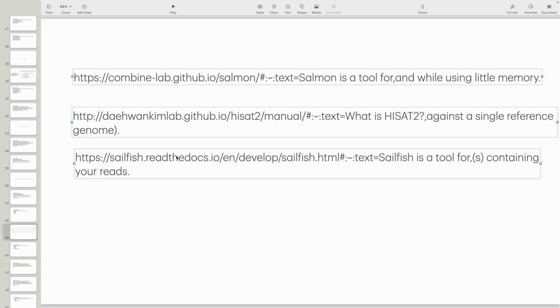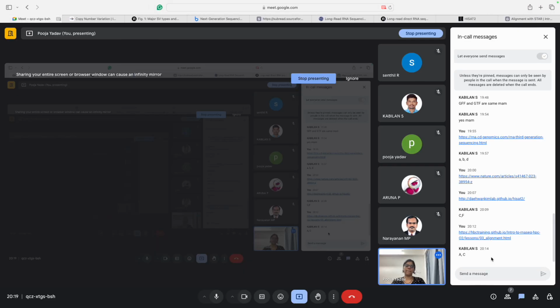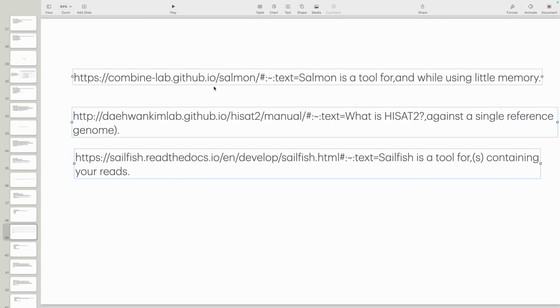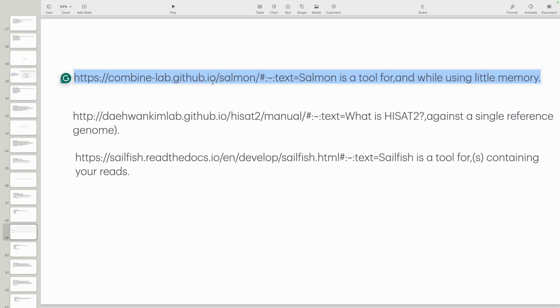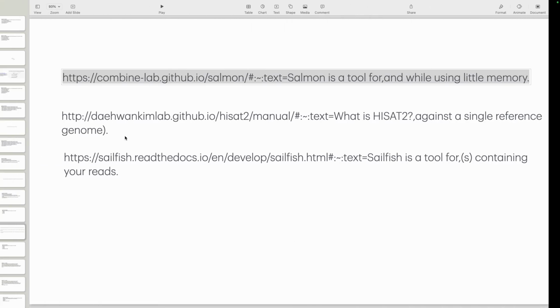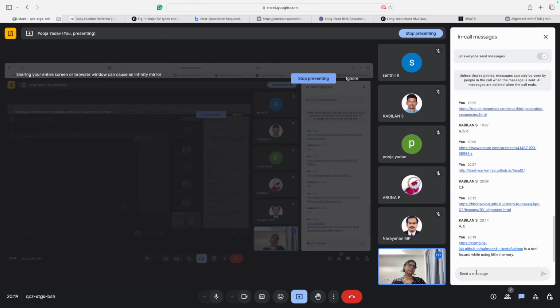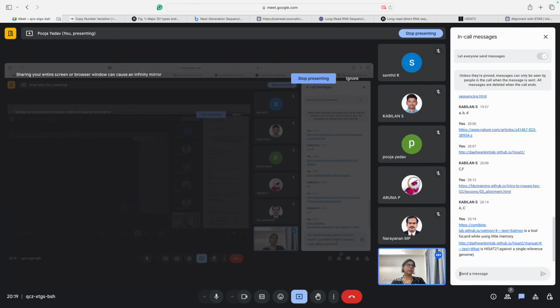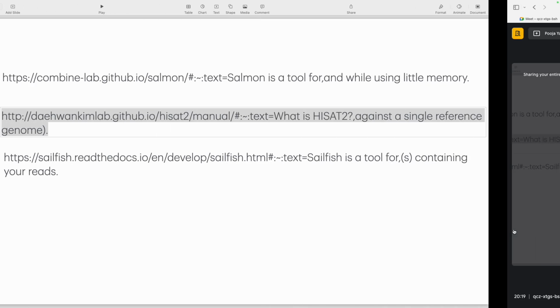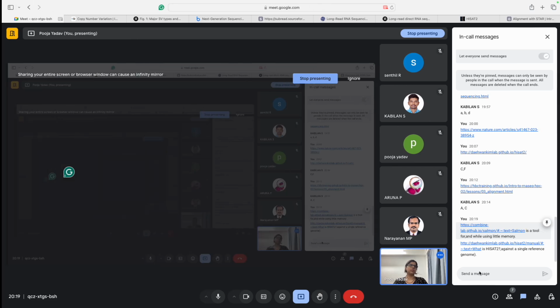just read these. This is for Salmon, this is for HISAT, this is for Sailfish.